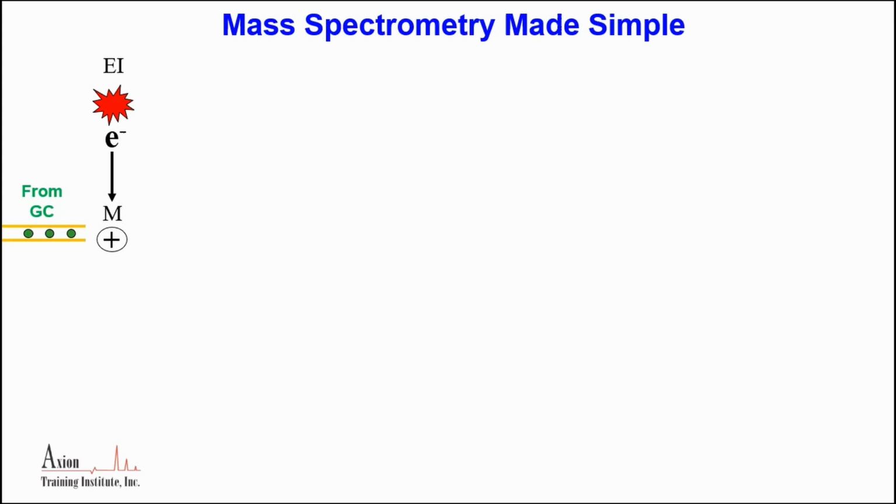So everything in GC mass spec takes on a +1 charge, or I should put it this way: if it's going to take a charge, it's going to be a +1 charge in GC mass spec. We do not get multiple charges. In LC mass spec, we do. In fact, we need to. If you want to weigh a 100,000 molecular weight protein, we can't weigh that. We need to put 100 charges on it to get it down to a 1,000 mass to charge ratio.